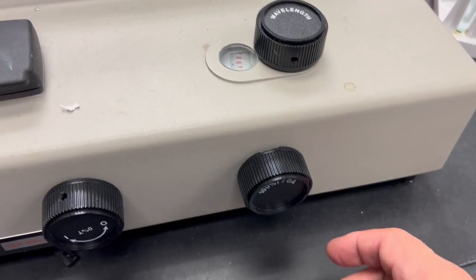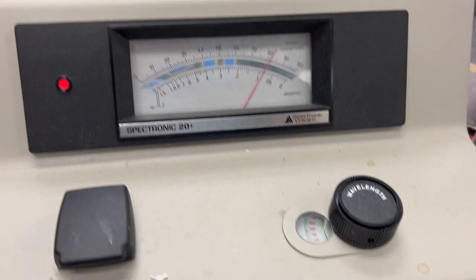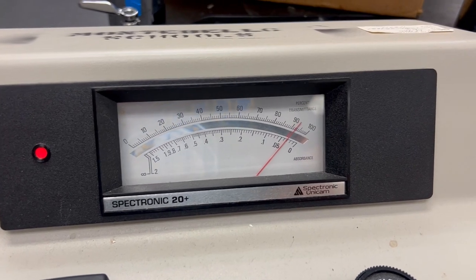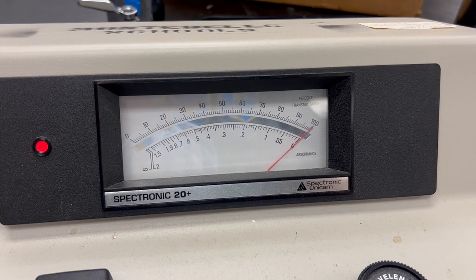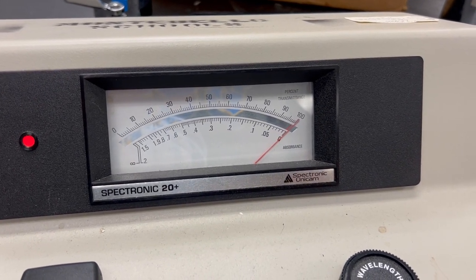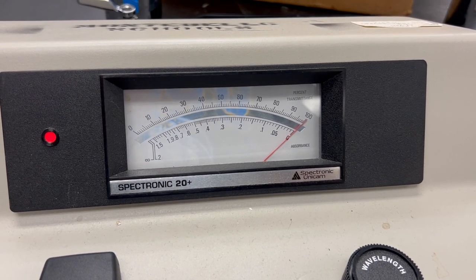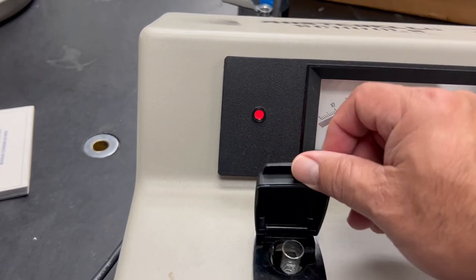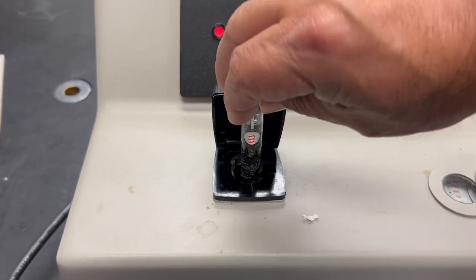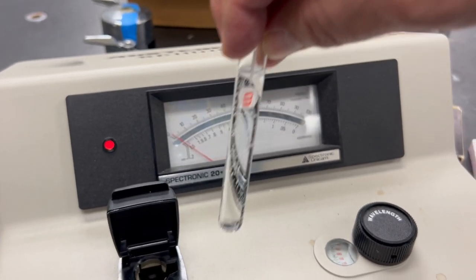With the water blank in, this should read 100. If it does not read 100, go to the second knob — the 100 knob — and dial it until your percent transmittance reads 100. So to summarize: use the left knob to set zero with nothing in there, then use the right knob to set 100 when you have the water blank in. This way, any light absorbed by the water will not be taken into account.